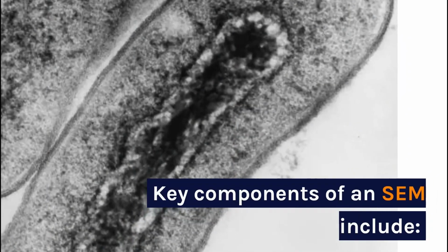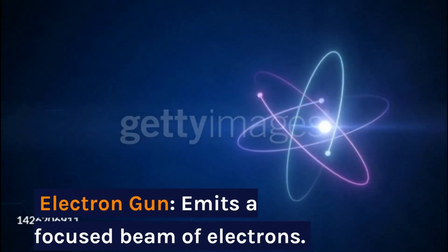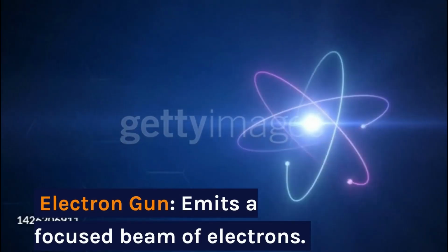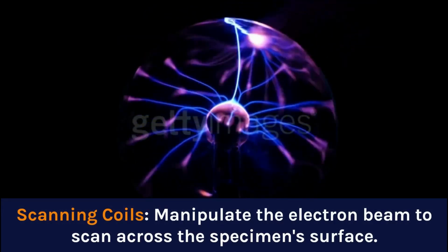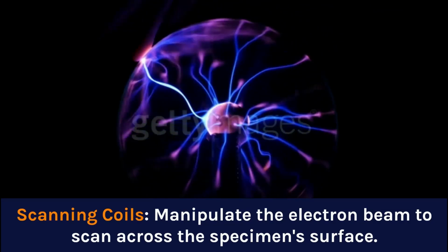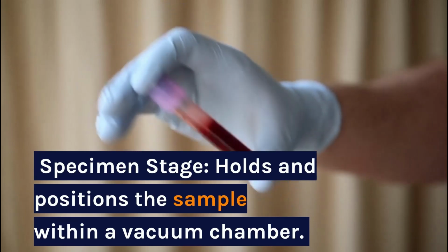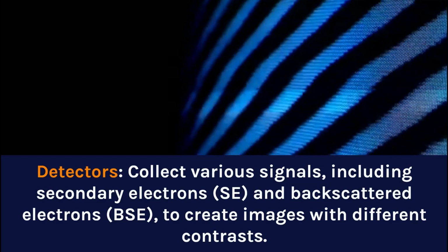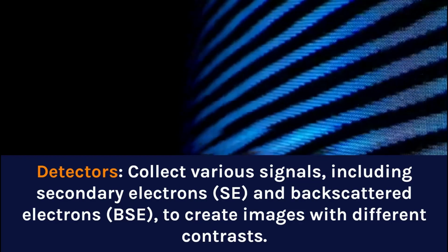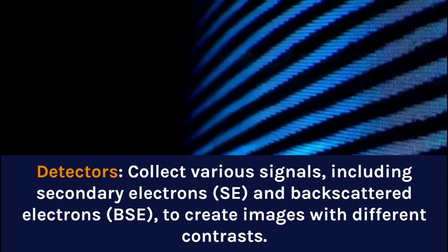Key components of an SEM include: electron gun, which emits a focused beam of electrons. Scanning coils, which manipulate the electron beam to scan across the specimen's surface. Specimen stage, which holds and positions the sample within a vacuum chamber. Detectors, which collect various signals, including secondary electrons (SE) and backscattered electrons (BSE), to create images with different contrasts.